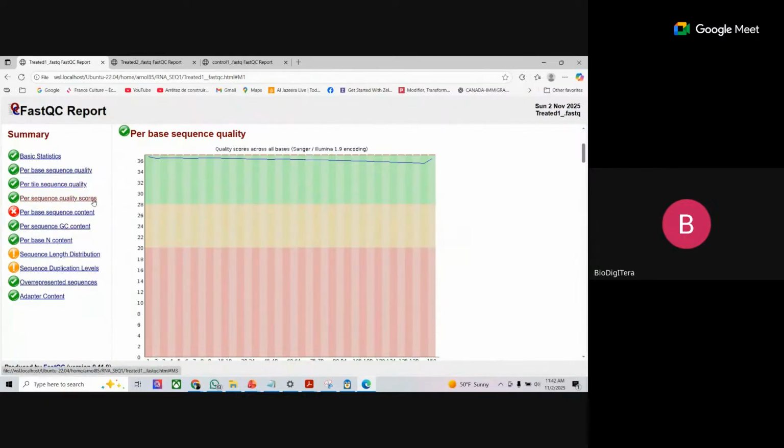I will give that as an assignment because today you will have a homework, something that you will do for this part. I want you to understand it very well, because if you understand this part, when you go to any kind of DNA sequence, if it is RNA sequencing or DNA sequencing, this part always gives the same thing. The interpretation is common for all genomics. So if you understand that, you can be sure that you have understood downloading, doing the quality check, and giving the interpretation. This is common.